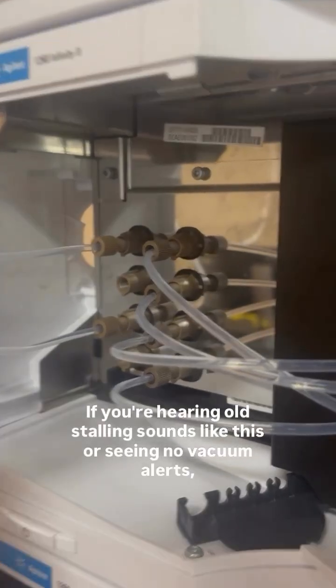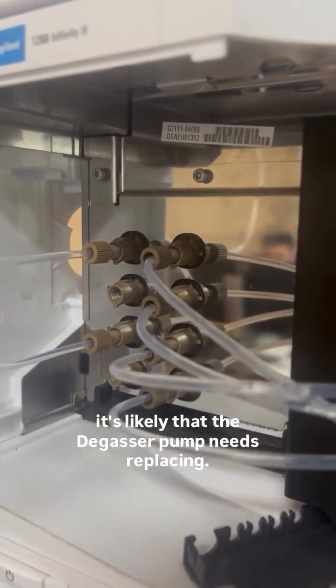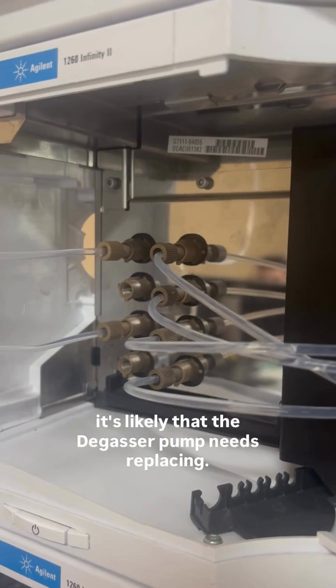If you're hearing stalling sounds like this, or seeing no-vacuum alerts, it's likely that the degasser pump needs replacing.